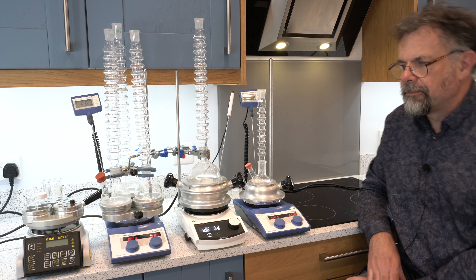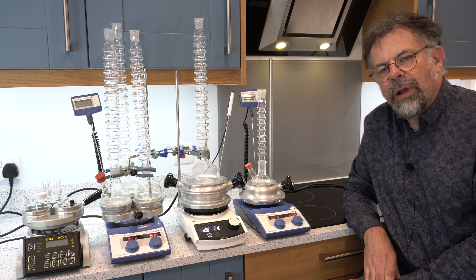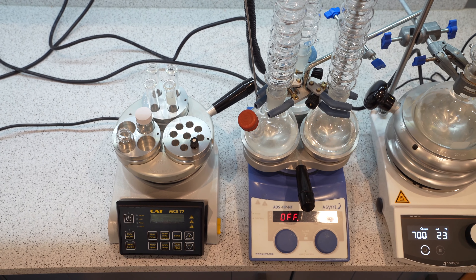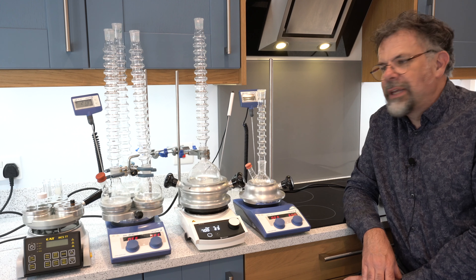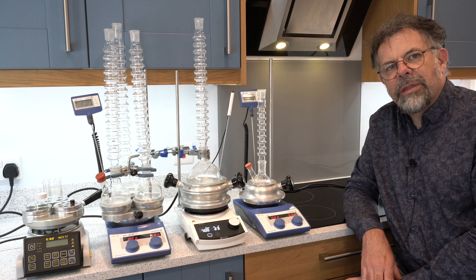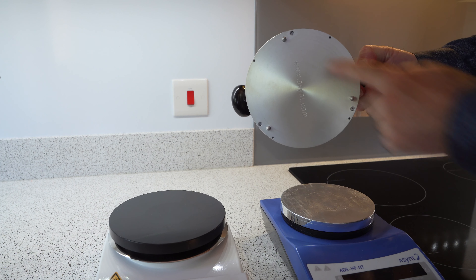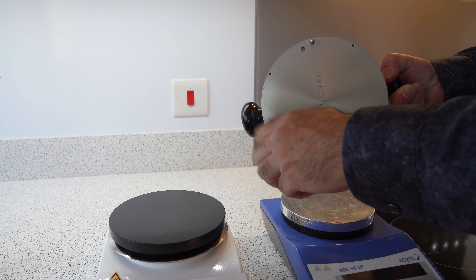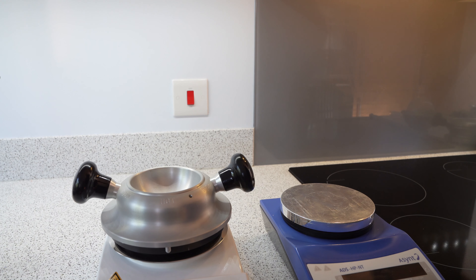At the far end we have our parallel synthesis DrySyn inserts. These offer the ability to heat and stir tubes and vials very easily on top of any magnetic stirring hot plate. As you can see, they fit pretty much any hot plate stirrer, and hopefully a little video will come up showing you how you can change the feet on the base to fit any hot plate stirrer.